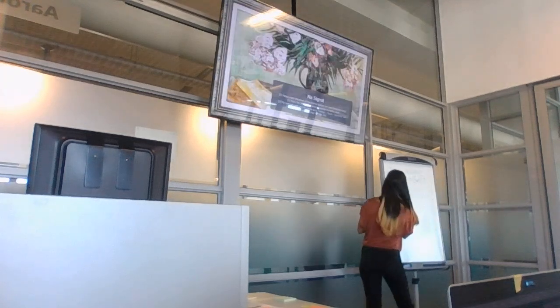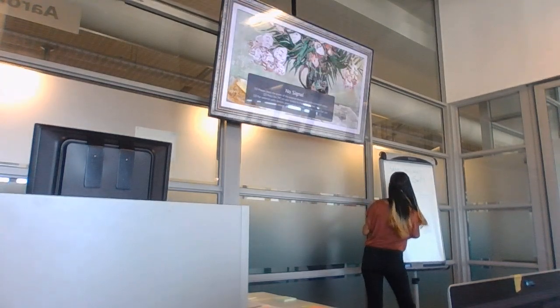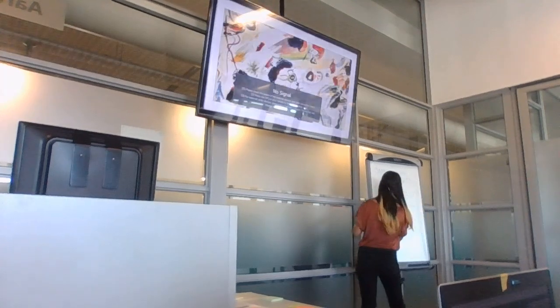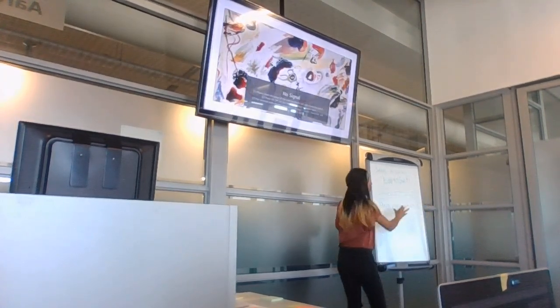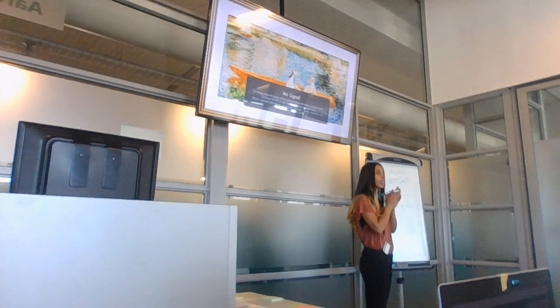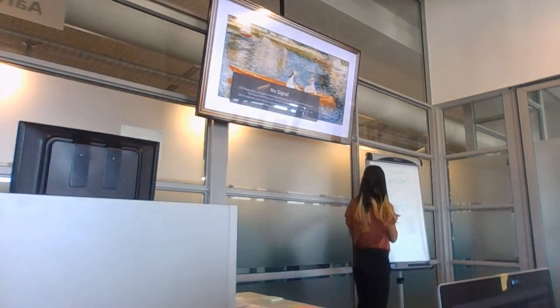Okay, so we're pre-processing your data, right? This is quality control of your data. You're going to look at what your data looks like, and you're going to do some type of analysis.